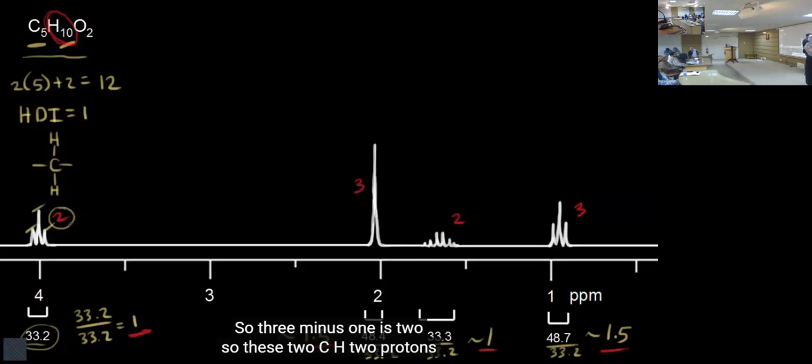Now, if we have it like this, 2 here, meaning 4, it means we have a CH3 and a CH2. So from where we were coming, we have one CH2. This can be part of it. Then there's another CH3 triplet. So we've been able to account for 3 carbon atoms out of 5. That is CH3, CH2, CH2.